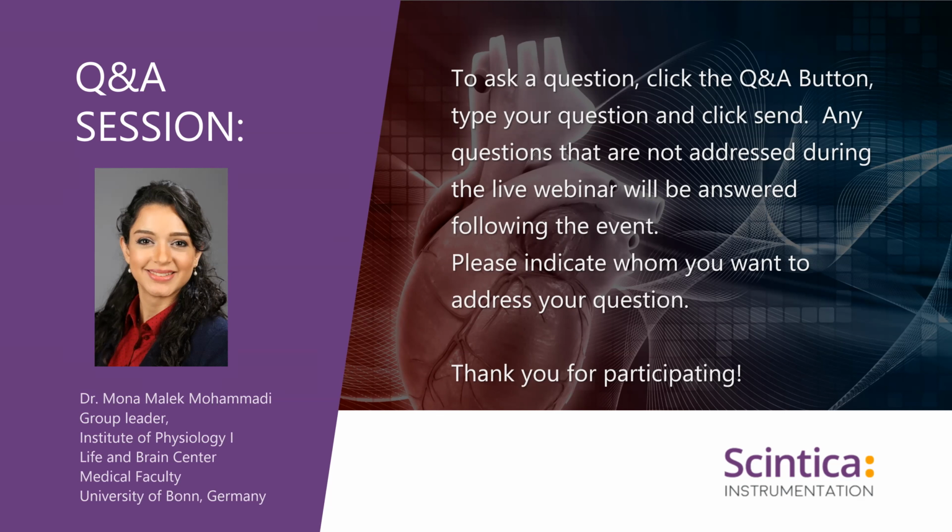Interesting. Based on the surgery, there's a question on the surgery practice. Dr. Pills asks, how do you avoid harming the tissue, heart, aorta, trachea, etc., when using sharp needles, 10-0, to insert the suture? Do you blunt them?